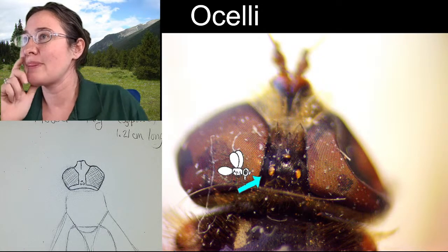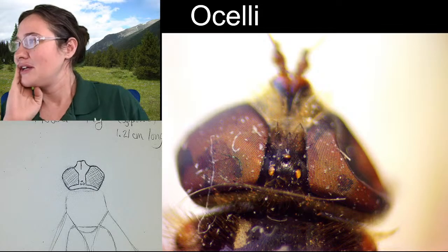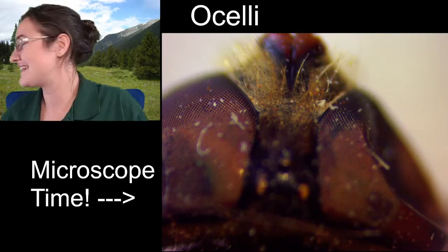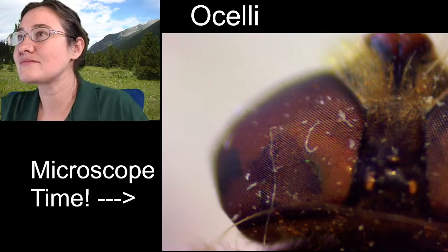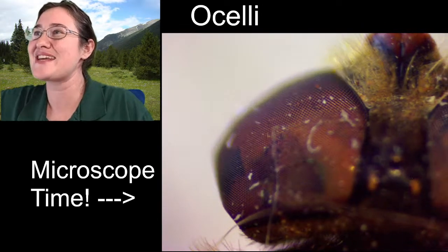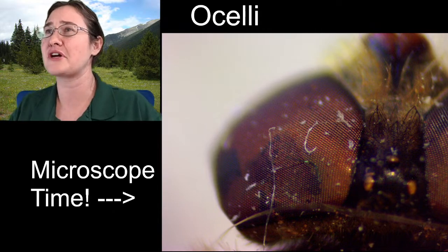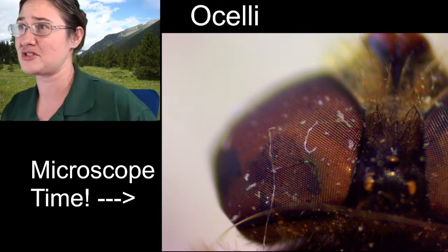Is anybody else loving the texture of the compound eyes? The compound eyes are always awesome. Let me go ahead and just zoom it in for you. It makes me a little sad when the insects are covered in dust and debris and stuff, but it's really difficult to clean them off. You can use a little paintbrush, but you also worry that you're going to knock off or damage the specimen too. You don't want to knock off hairs or the antenna because you're trying to clean dirt off.